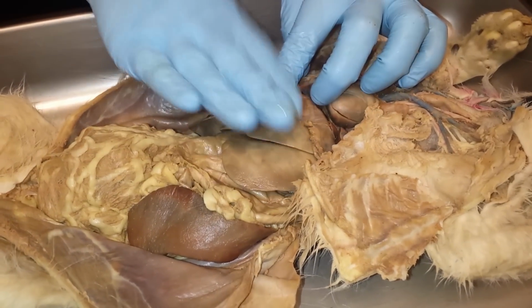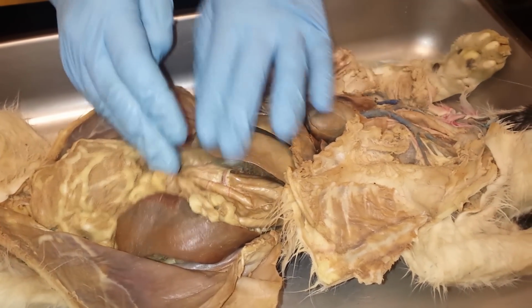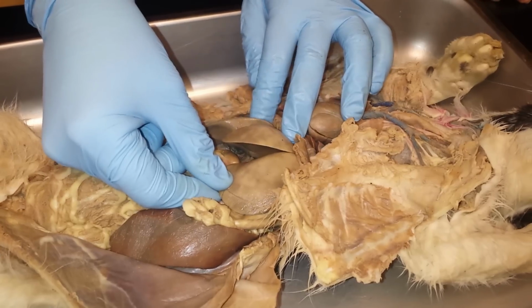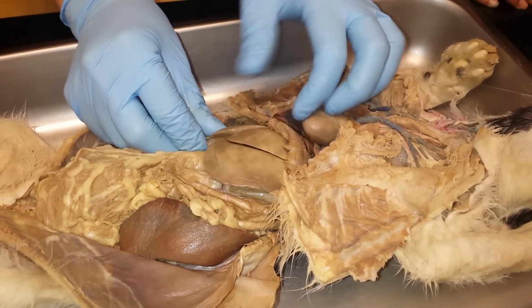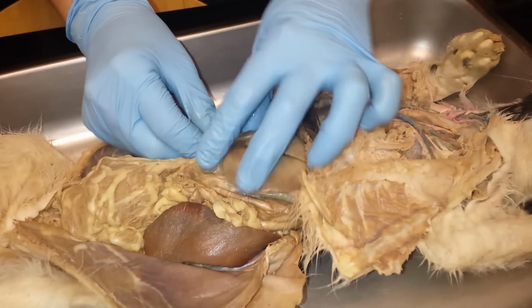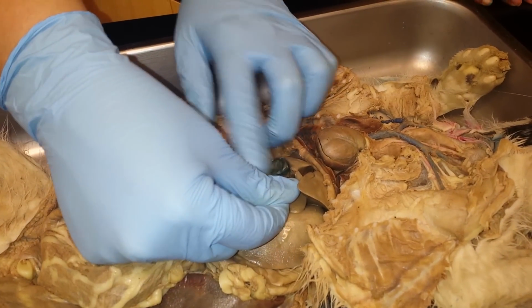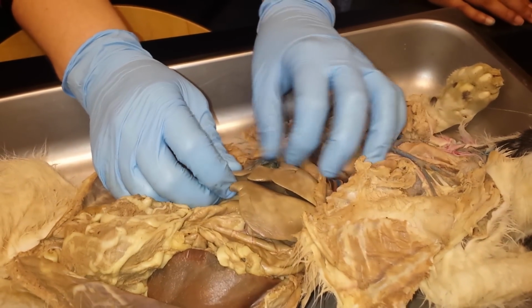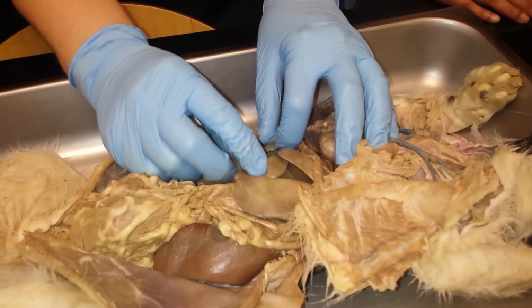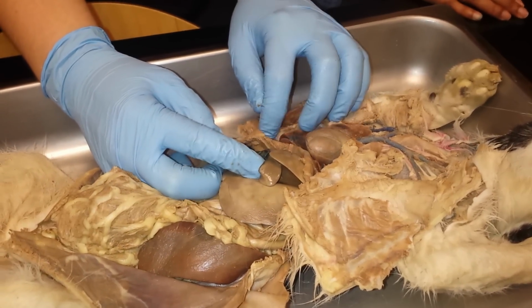The organ that lies kind of on top of it, above, superior and anterior to the stomach, this is the liver, okay? Multiple lobes, huge organ right under the diaphragm. Sandwiched in between the lobes of the liver is this balloon-shaped organ right there. Does everyone see it? Sometimes it can be really, really green. It depends on the concentration of the bile at the time of death, but this is the gallbladder, okay?